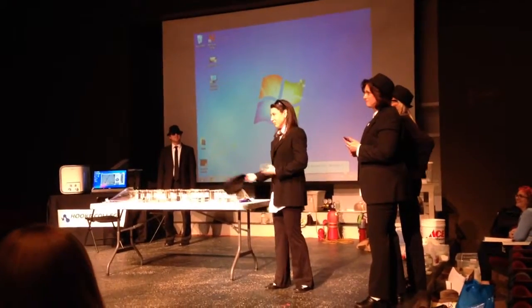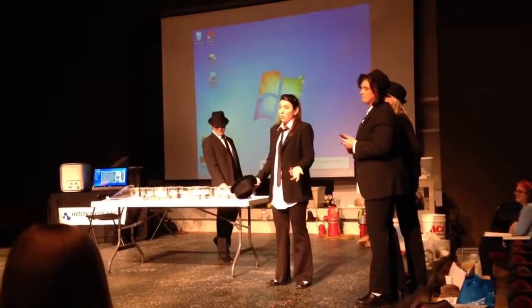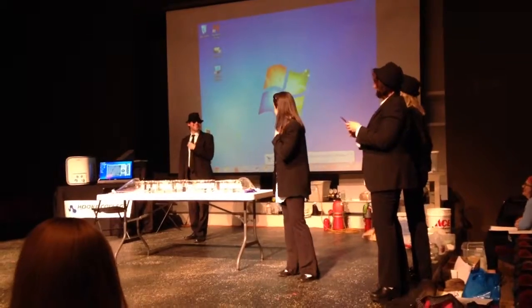Of the iodine clock because, again, you've seen the iodine clock reaction before, but we're just going to dance to it and have no words or an explanation. Oh, we were explaining at the end, okay. Oh, I'm not explaining at the end.